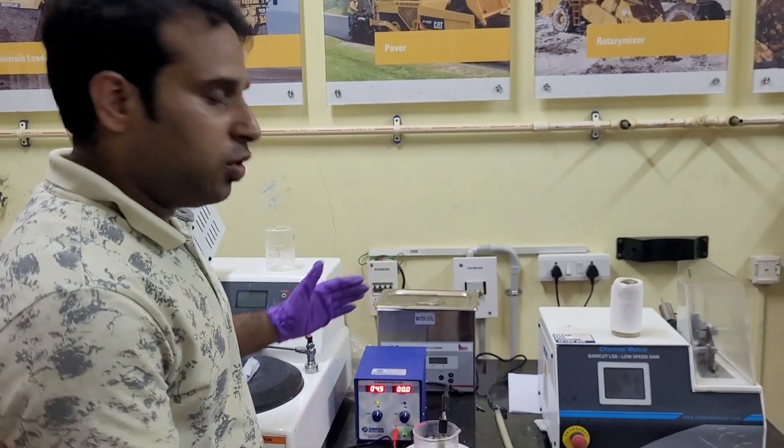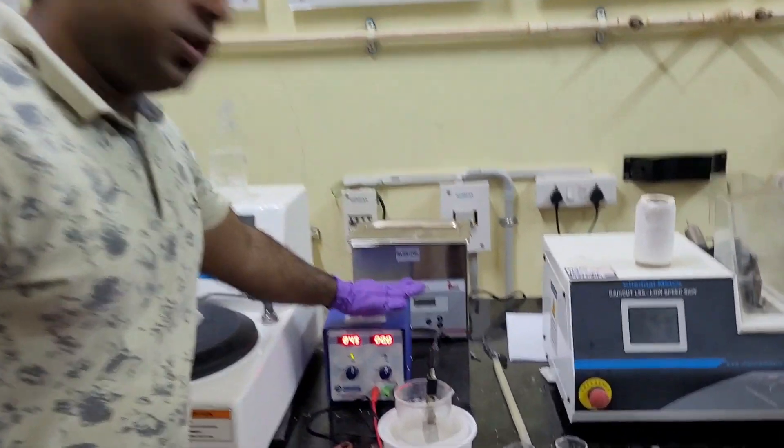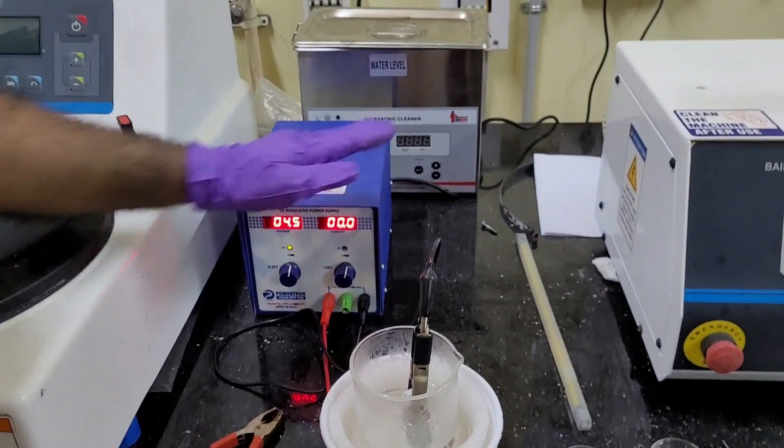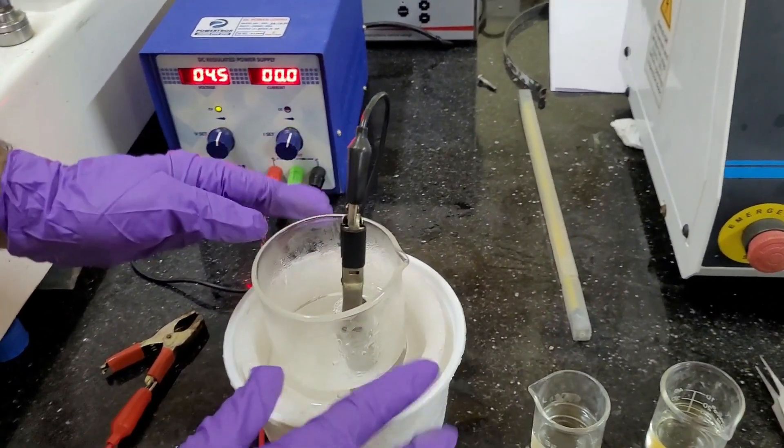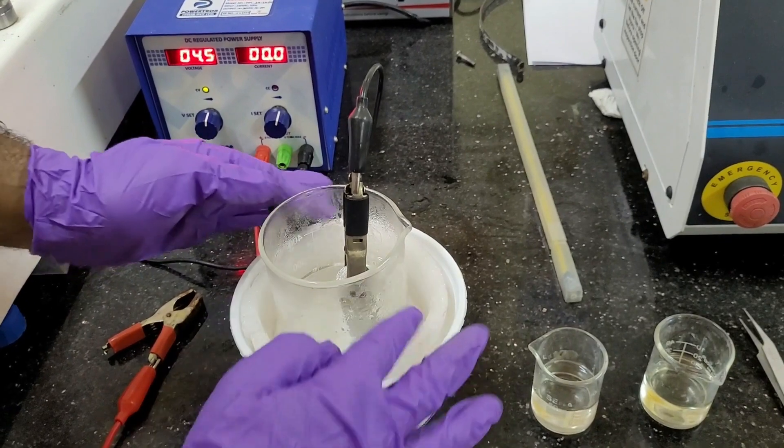First of all, I would like to give a little introduction about this setup. So, this is the voltage and current control unit. And this is the specific kind of setup where we can put a beaker. And outside this beaker, there is some space.